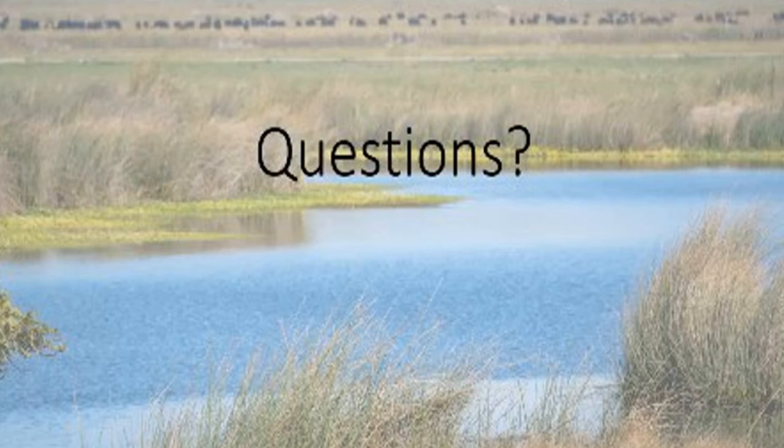Thank you. I'll answer the last question first. And so the goal, or I think one of the ultimate goals, is to be able to use the autonomous eDNA samplers kind of as a first defense of detecting Delta smelt DNA in the system as they kind of get closer to the pumps.